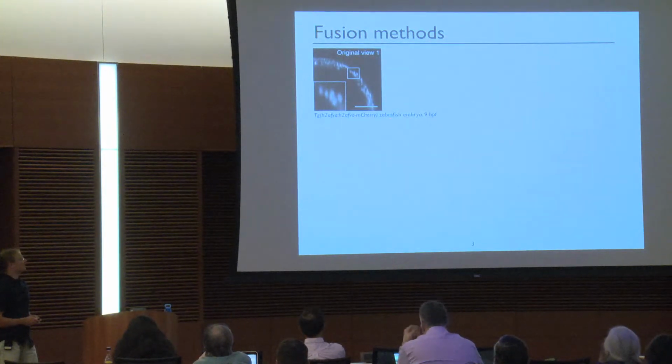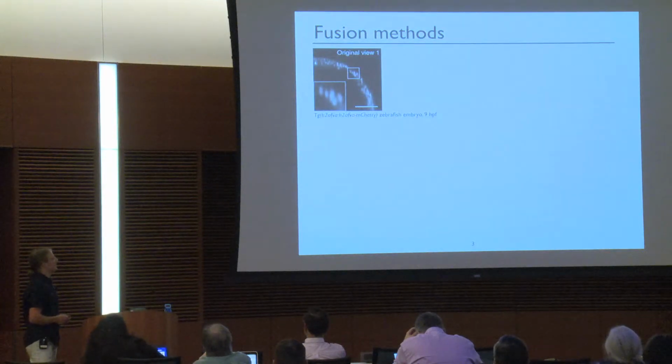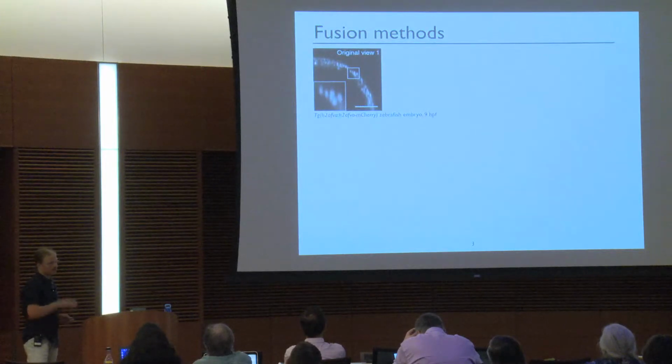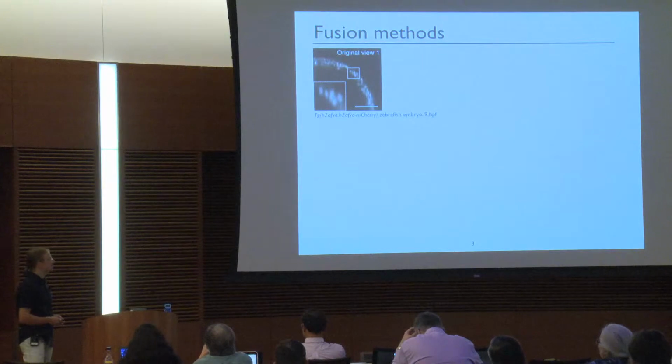So here is a single image, and that's actually not an image how it comes from the camera, but it's a view from top, so it's a cross-sectional plane. That's just nuclei from a zebrafish embryo. And the detection axis is vertical here, which you can easily see due to these nuclei being elongated vertically. Which is because the axial resolution in SPIM, as in many other microscopy techniques, is worse than the lateral resolution.